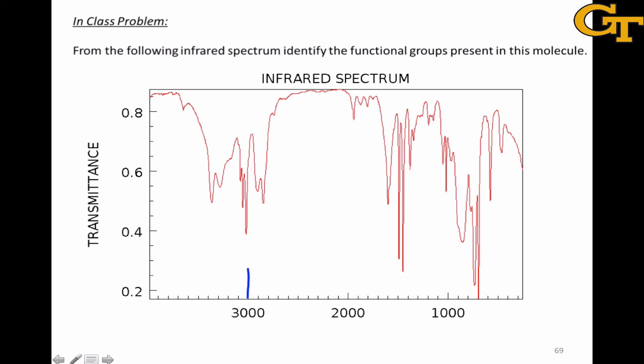In particular, we can notice that we see, in addition to some CH peaks that are north of 3000 indicating CSP2 or SPH stretches, we also see these two peaks farther out which seem to be indicative of an OH or an NH.